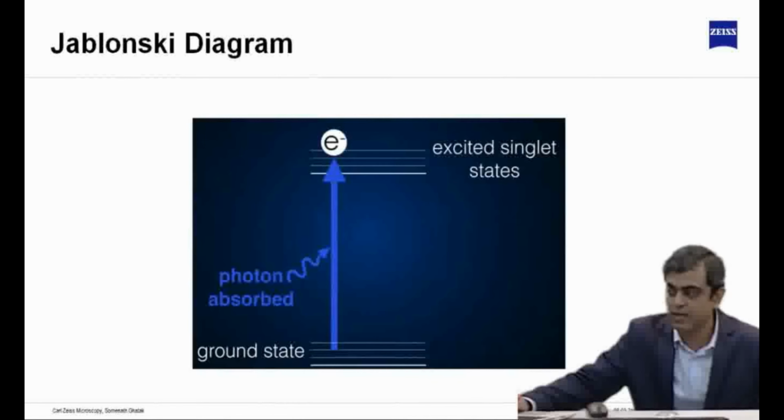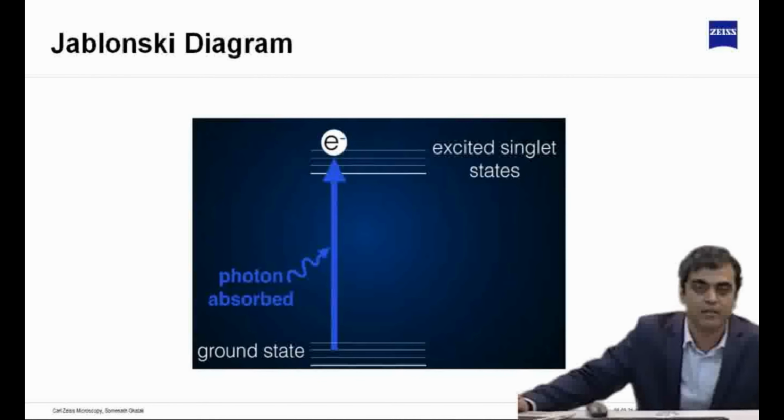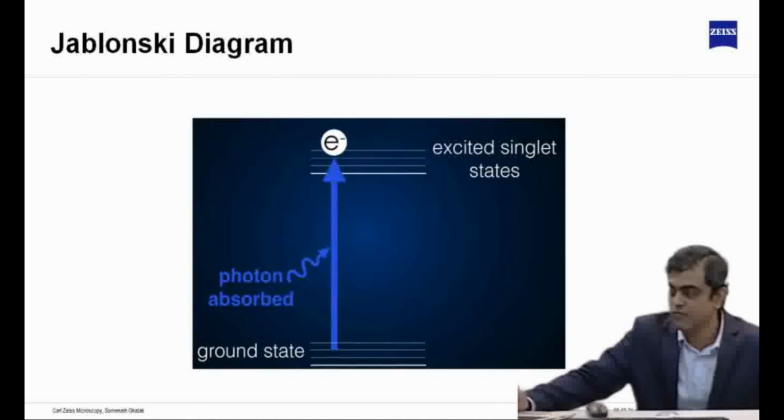So, a quick look at the Jablonski diagram. I think all of you have seen this, and it's well known, but still it's so fundamentally important that whenever we excite a fluorophore with a particular wavelength and the energy associated with that wavelength, it excites the fluorophore from the ground state, which is the resting state, to an excited state.